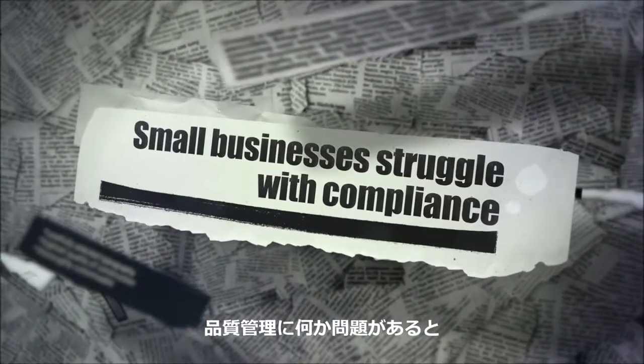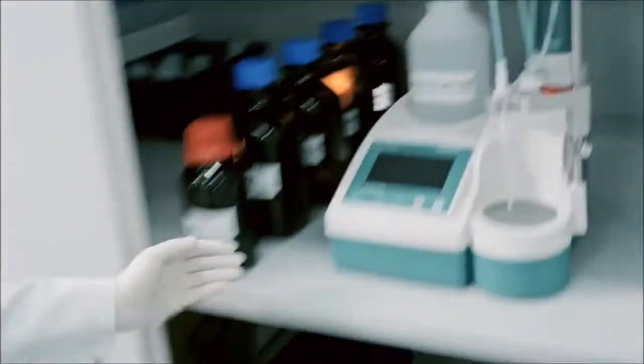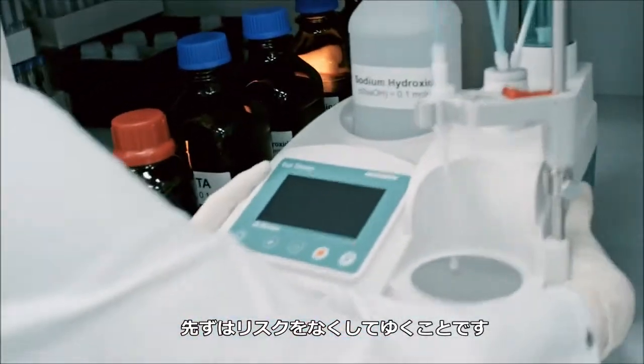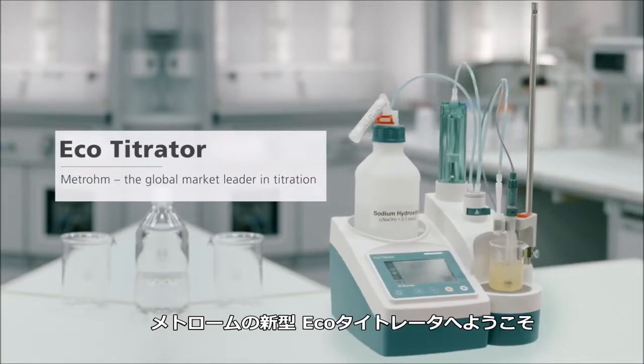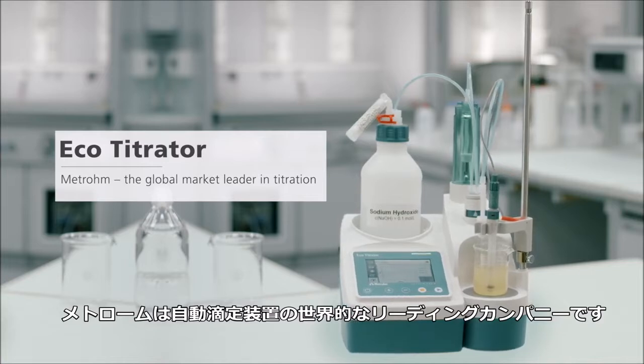When something goes wrong in quality control, the reputation of your brand is at stake. Better to exclude risks in the first place. Welcome the new EcoTitrator from Metrohm, the global market leader in titration.